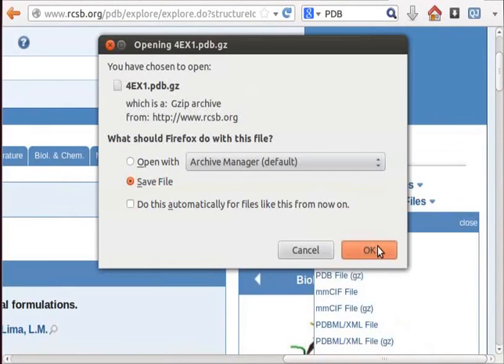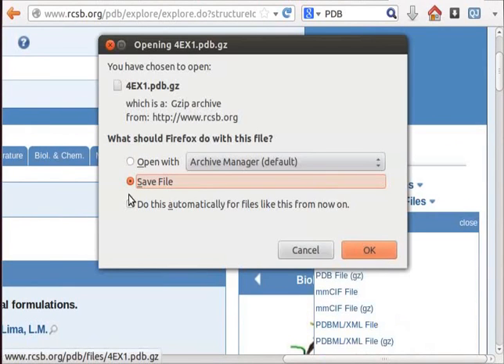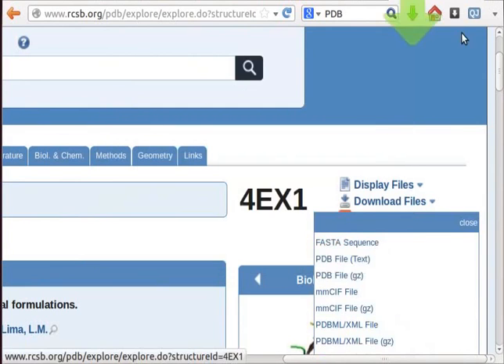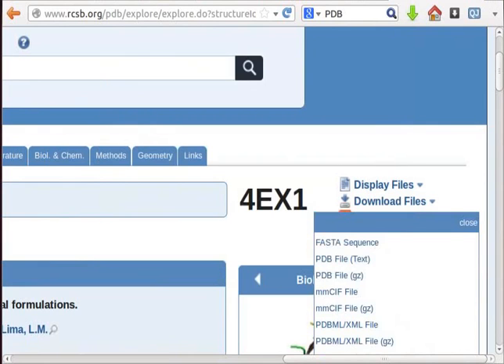A dialog box opens on the screen. Select save file option. Click on OK button. The structure of protein will be saved as 4EX1.pdb.gz in the downloads folder.